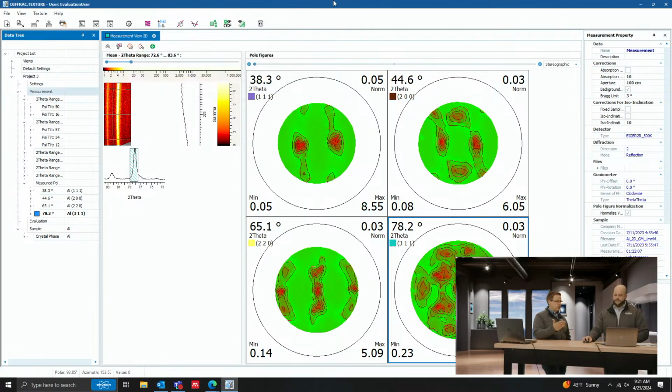You have to understand there's crystal symmetry, and that's the Miller indices. That's seeing what the unit cell looks like. But then there's process symmetry. Exactly, and process symmetry has to do with the processes you do. Are you rolling the material in a certain way? Are you punching the material? If you're depositing it, is it coming in at a certain angle? Exactly. So be thoughtful when you mount it.